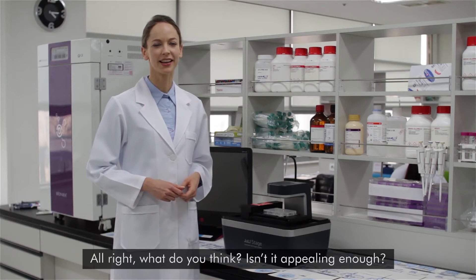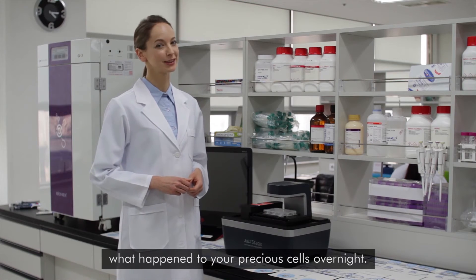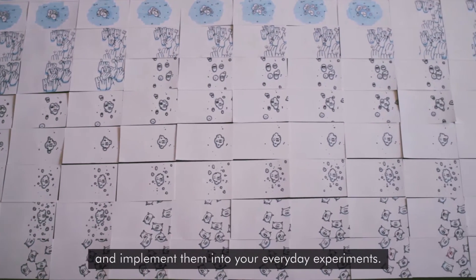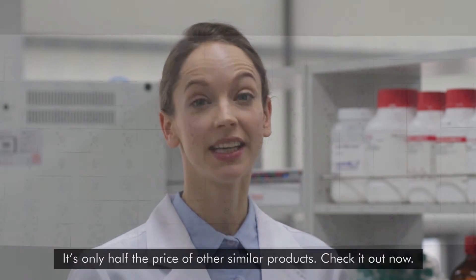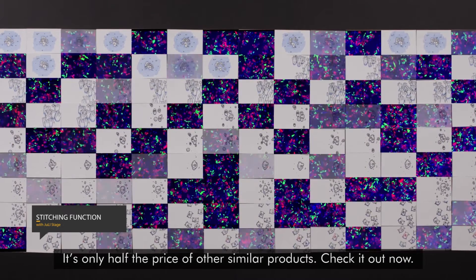What do you think? Is it appealing enough? You don't need to worry anymore about what happened to your precious cells overnight. With Julie Stage, you can easily take live cell images and implement them in your everyday experiments. Is it expensive? Not at all — it's half the price of other similar products. Check it out now.